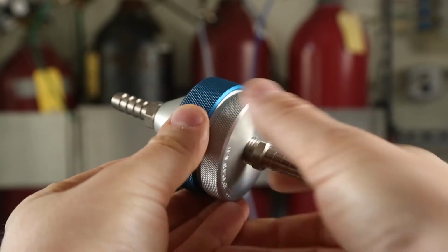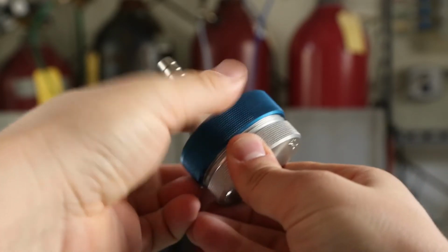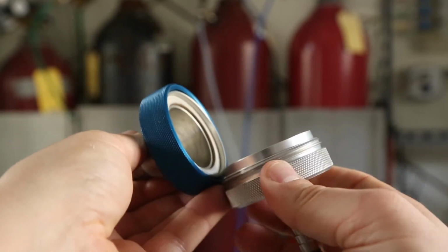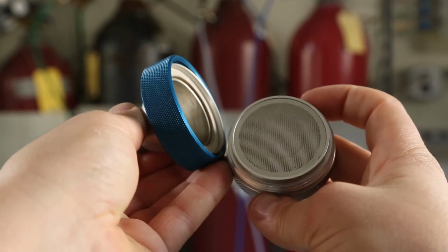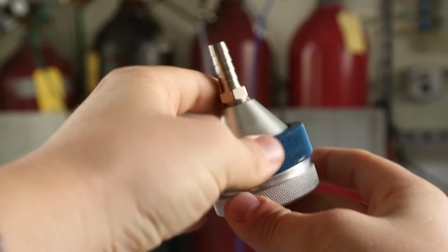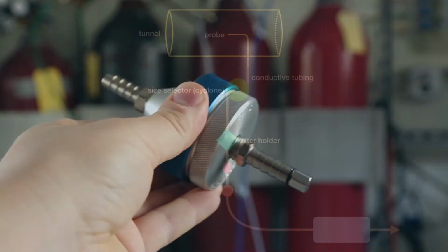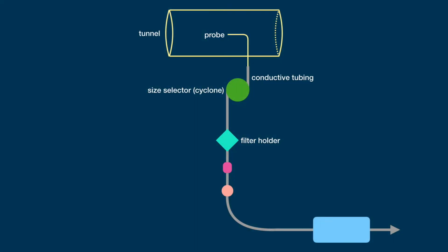A larger total deposited aerosol mass may be useful if your laboratory does not have an analytical balance with very fine resolution. Our lab uses 47 mm diameter filters with a duct flow rate of 325 cubic meters per hour and a gravimetric system flow rate of 16.7 liters per minute. We find that, with this combination, we can perform tests on a wide variety of stoves, accumulating total aerosol deposits of between 100 micrograms and several milligrams. If your lab uses a significantly lower duct flow rate than ours, tests extremely dirty stoves, or cannot afford a balance accurate and precise to roughly plus or minus 10 micrograms, you may need to use larger diameter filters.